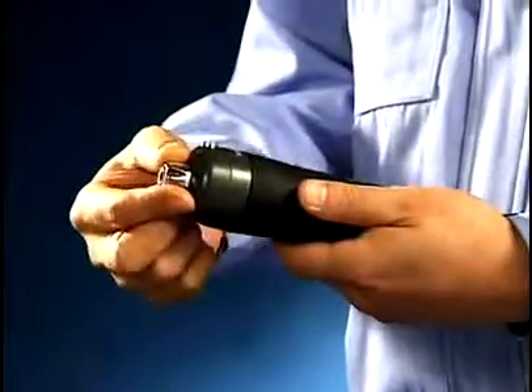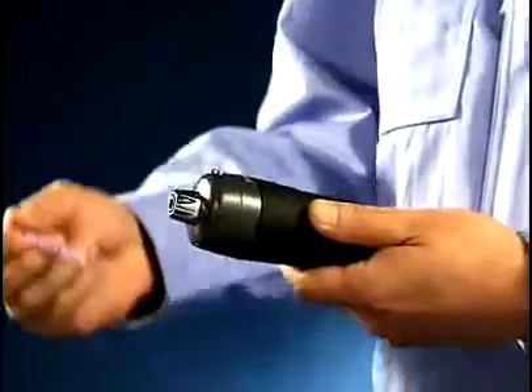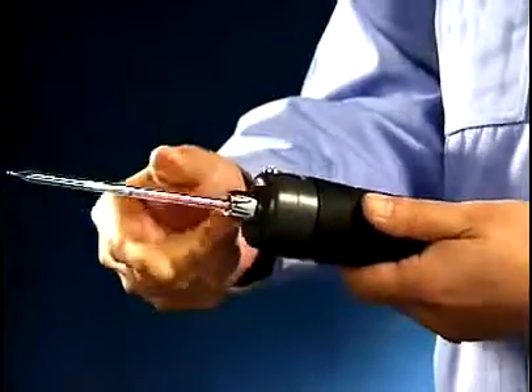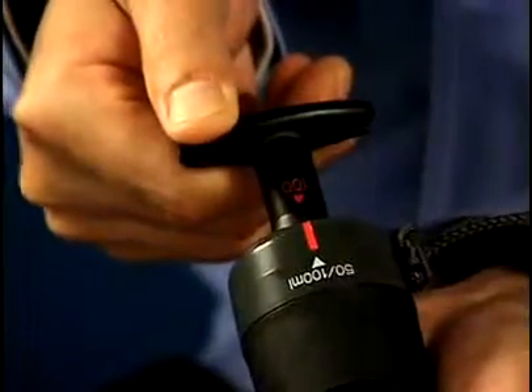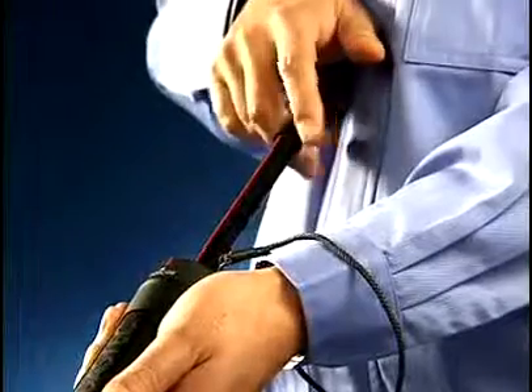Be sure that the inlet clamping nut is firmly tightened. Insert an unused detector tube into the rubber inlet flange of the pump. Push in the handle and align the red line with the 100 milliliter marking. Pull the handle back to the full 100 milliliter position, locking it in place.